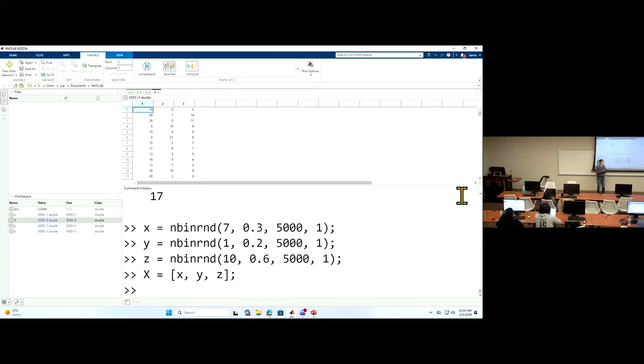Make sense? Okay. So one function's output is given to another function as a parameter. So in that way, you simulate the whole parameter space.